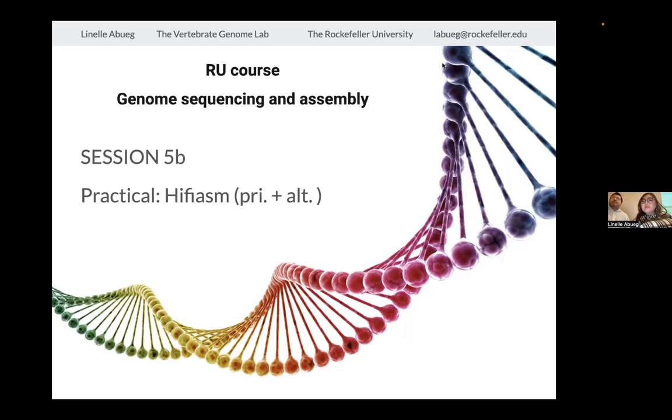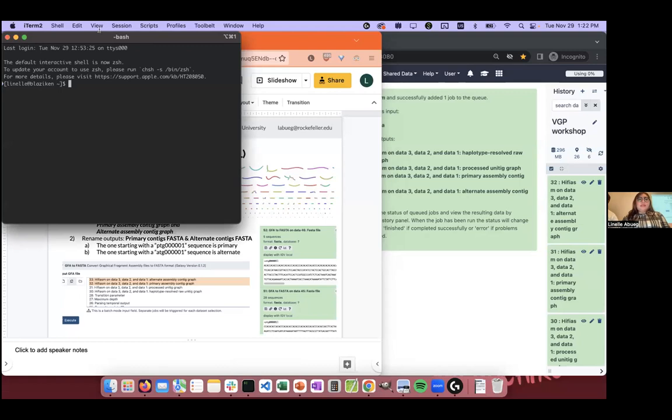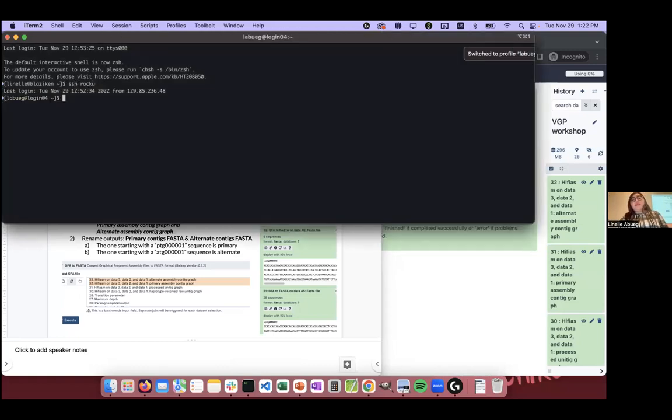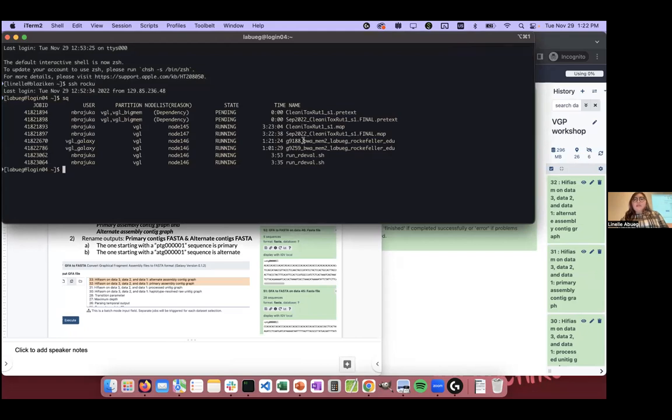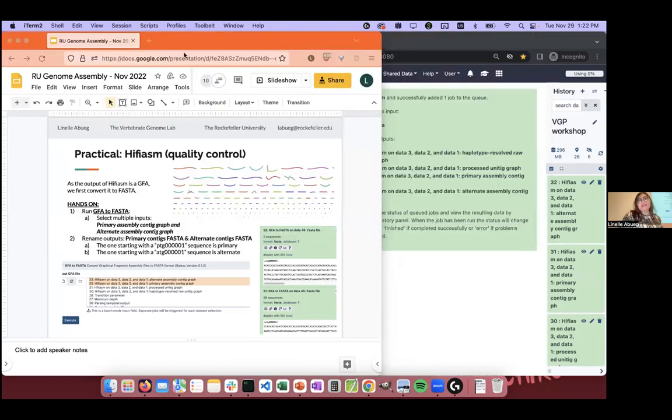Okay, so did I go faster than the assembly? Let's see. You can close this real quick and I can peek at the cluster. Well, yours is finished. Well, mine, yeah. I don't know if there's, nope, everyone's done. Nothing's running. We wanted it running in human time, so this is good.